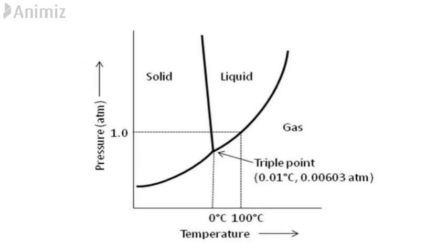So here, a substance is dried at a temperature and pressure below the triple point of water. A triple point is a point where water exists in all the three phases, that is solid, liquid and gas. It is achieved at a temperature of 0.01 degrees Celsius and a pressure of 0.00603 atmosphere. So if a substance is dried at a temperature and pressure below these conditions, then solid ice can be directly converted to gas without entering the liquid state.